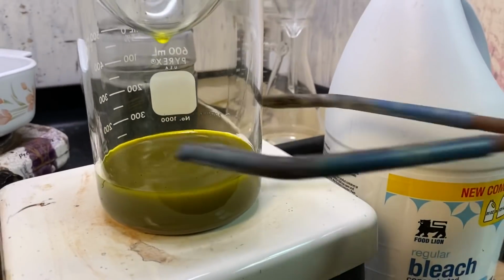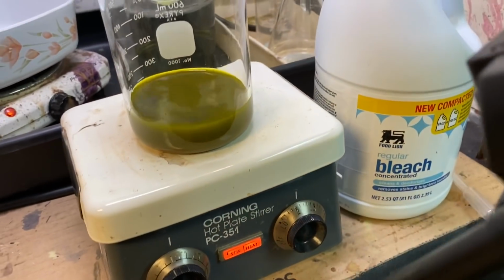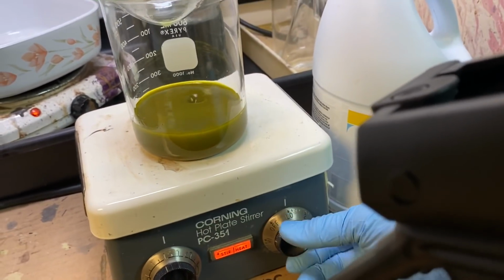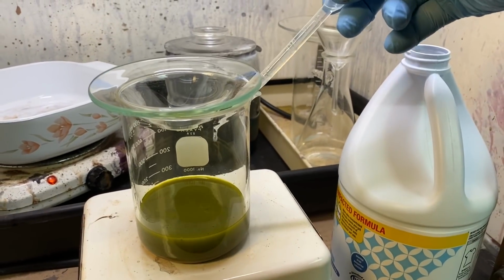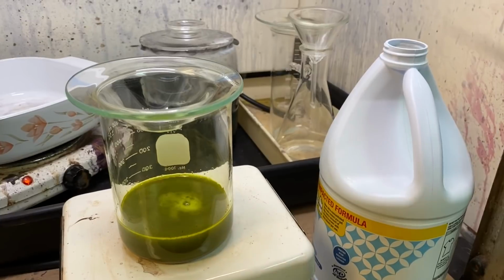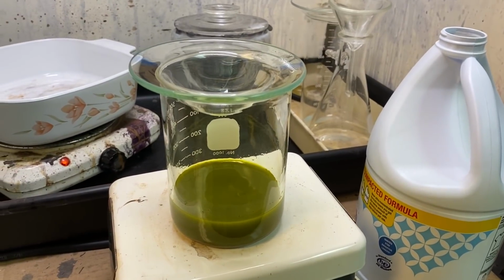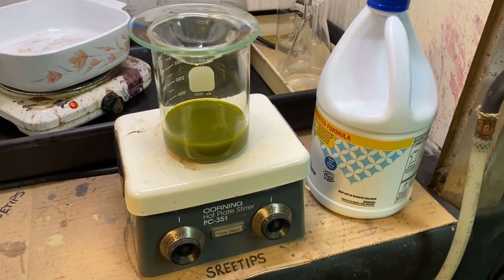Okay, I think we've got everything to go in solution now. If you look under there, I see some sediment, but I don't think it's going to be gold. It's some kind of brown looking material, probably just dirt. So I think what we'll do now is turn the heat off. All right, I'm going to add one more squirt of bleach just for good measure, just to make sure we've got all the gold to go in solution. I'm going to turn the stir bar off now. We'll let this cool down.